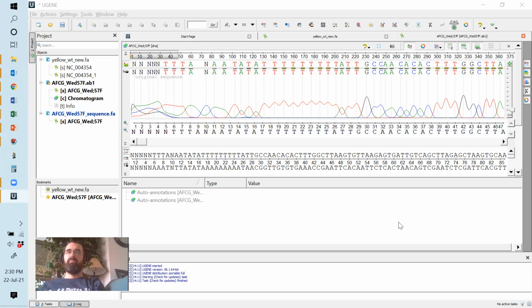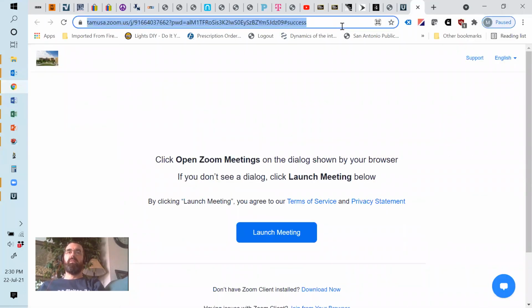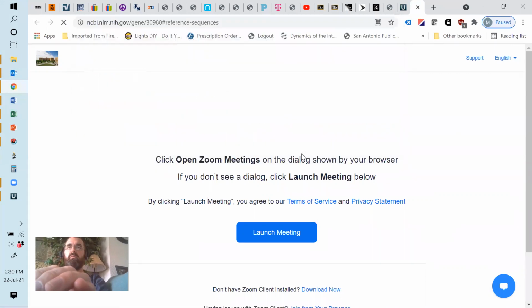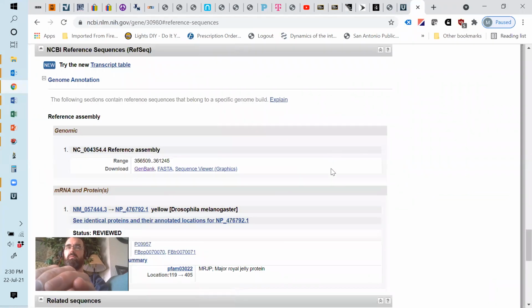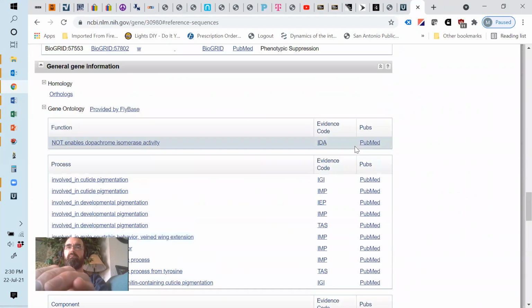So that's where we had to go to the top right-hand corner and click on send to, and then create file, and then it gave us the automatic option to have it as a report. Hang on. So this is back in the NCBI. Yeah. And I had created a folder and named it, and then I downloaded the file from NCBI or whatever. And then it just pops up as a text file.